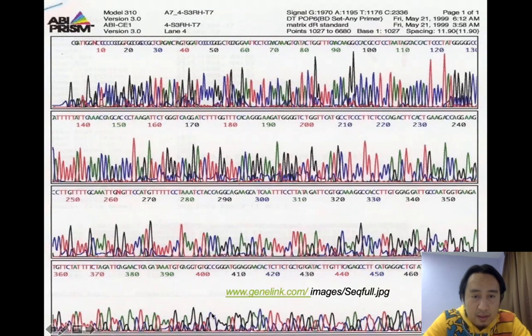Okay, at the top here there are two peaks, two blue peaks, which is blue what? Blue is C. So yeah, C. So blue is C, giving two peaks. These peaks are not separated and not spiking like the previous one. So even though it gives a correct sequence here, C here, you can't confirm it 100% that this position belongs to C. So you have to double check it with a sequence alignment.